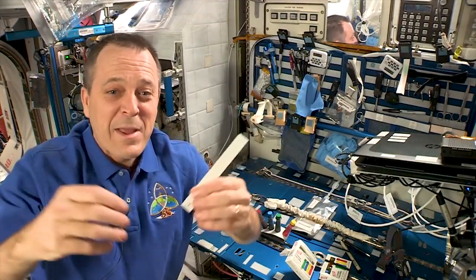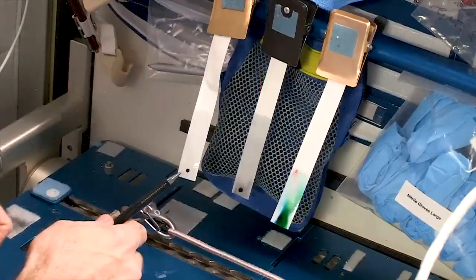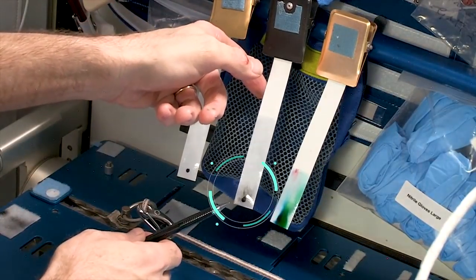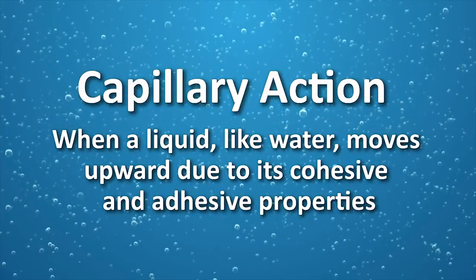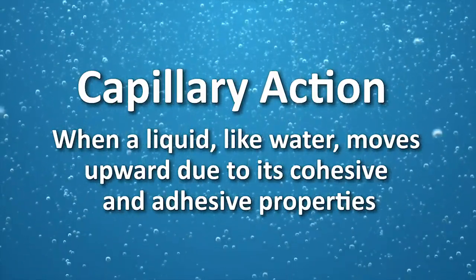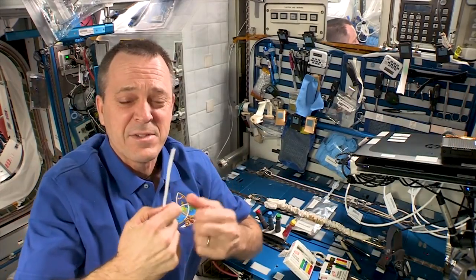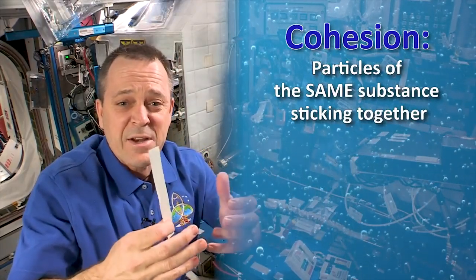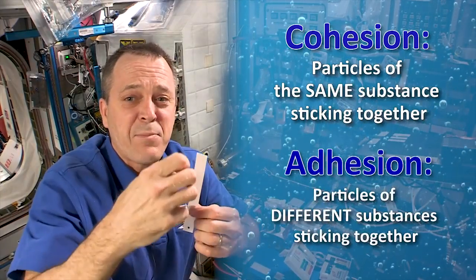Now that we know what black ink separates into, let's think about how the water was able to move through the paper. I put a drop of water in just one spot, but as you can see, it moved along the paper on its own. How does it do that? Well, it happens through a process called capillary action. Capillary action is when a liquid like water moves upward due to its cohesive and adhesive properties. Water molecules are able to essentially stick together — which is cohesion — and they can also stick to a surface or container, in this case the paper, in a process called adhesion. And that adhesion pushes it upwards.